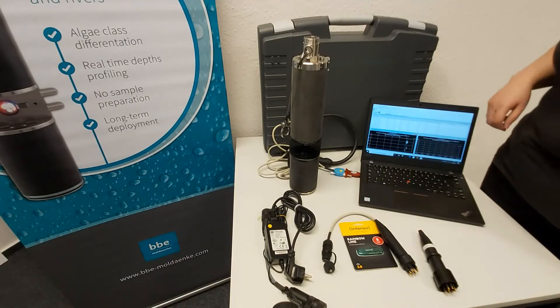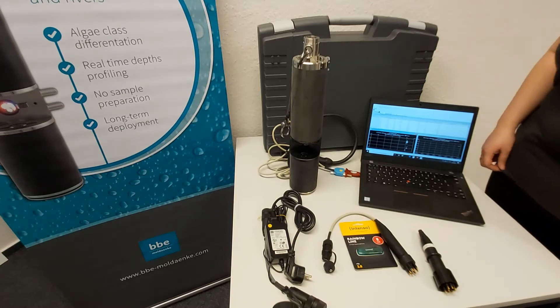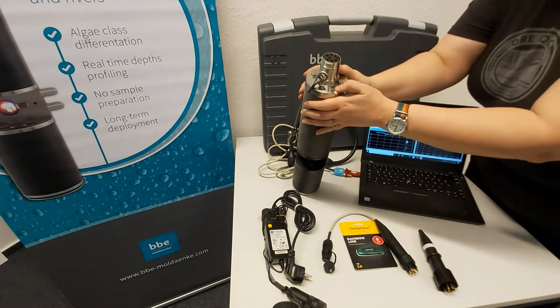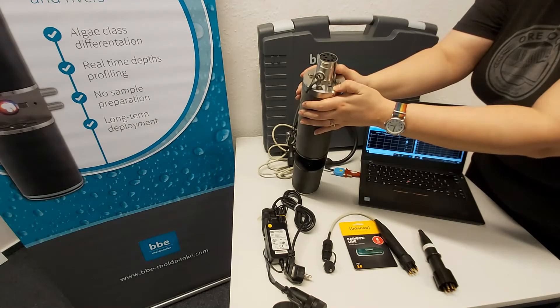Now we'd like to tell you a little bit about some of the accessories that come with the FluoroProbe. First of all, I wanted to point out the LED light on top, which indicates the battery charge level.